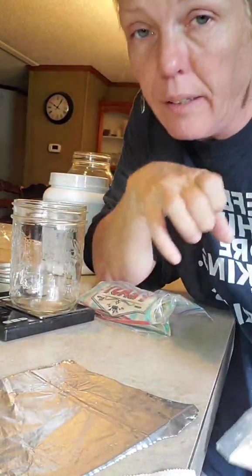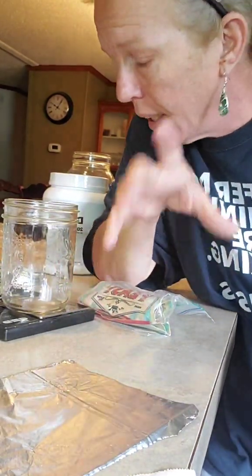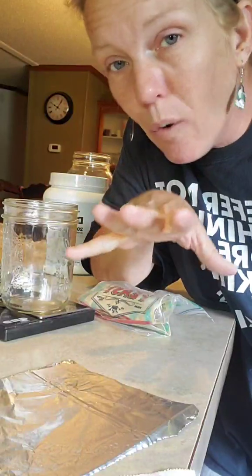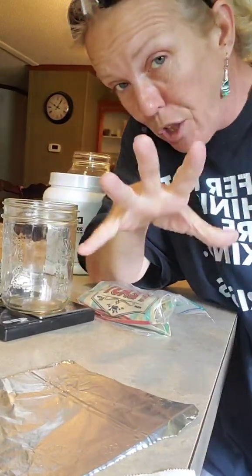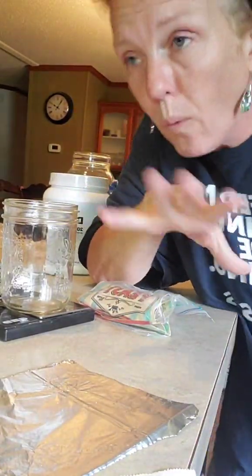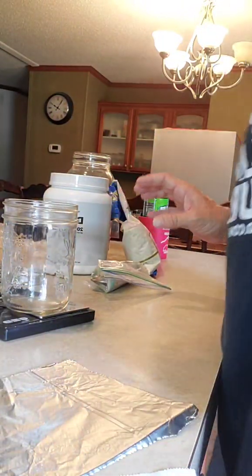Malt extract yeast agar is primarily the agar that I use. That's what I grow everything on. I'm not going to tell you how much dextrose I put in it because we're leaving that out when it comes to your stuff. So, my recipe, and it is important.